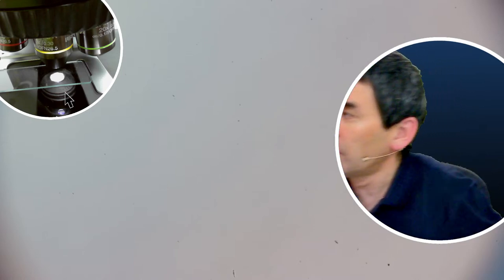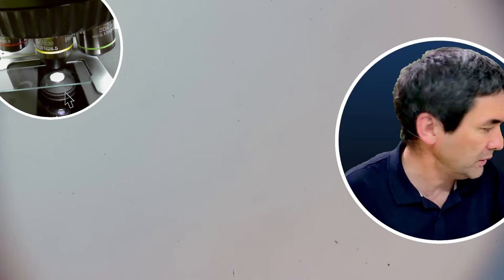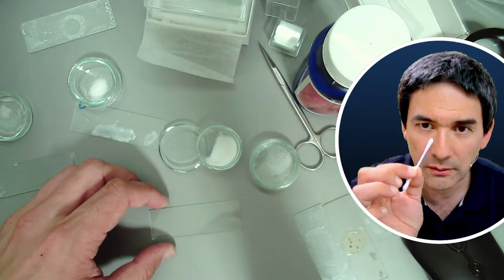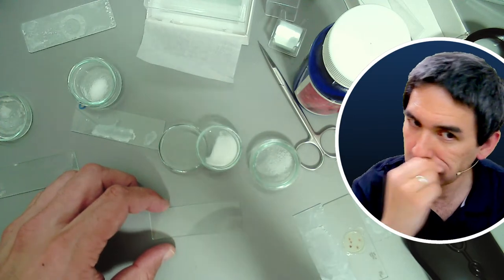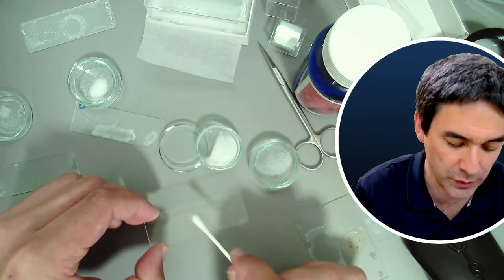So you know what I'm going to do? I'm going to try it in any case, not using skin cells but using cheek cells. And what I'm doing now is, as you have already seen before, I'm going to do the desk view again. So let's see if body cells are polarizing or not. Okay, a cotton swab. Collecting cells. Okay, and we're going to streak it.